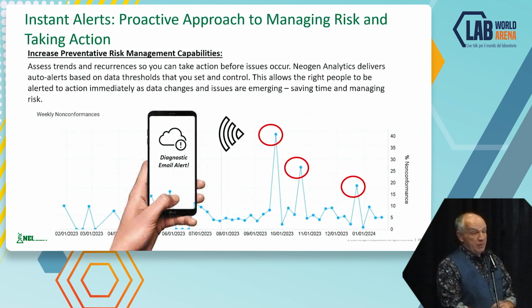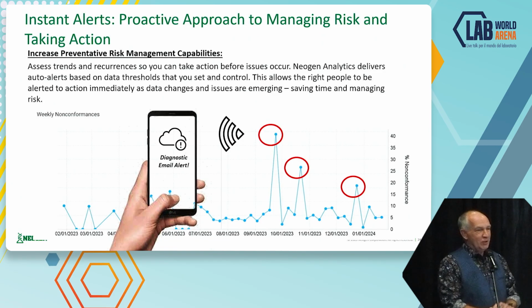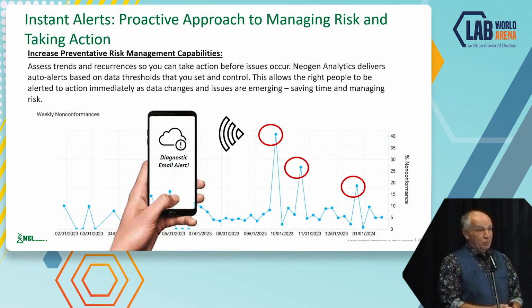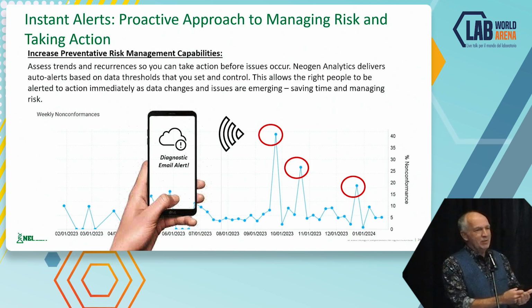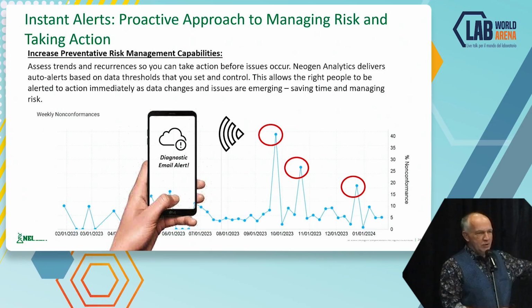You can even set up an alarm. I'm not sure if I want that as a quality manager, but maybe it's important that you get a message and you know, oh, I need to call somebody to trigger something. If you work in a quality department, you may know that getting listened to is not so easy. So if you want to show something to the management and you come to them and say, oh, let me explain, I need some support here. Not so easy. If you can show data, it's much easier.